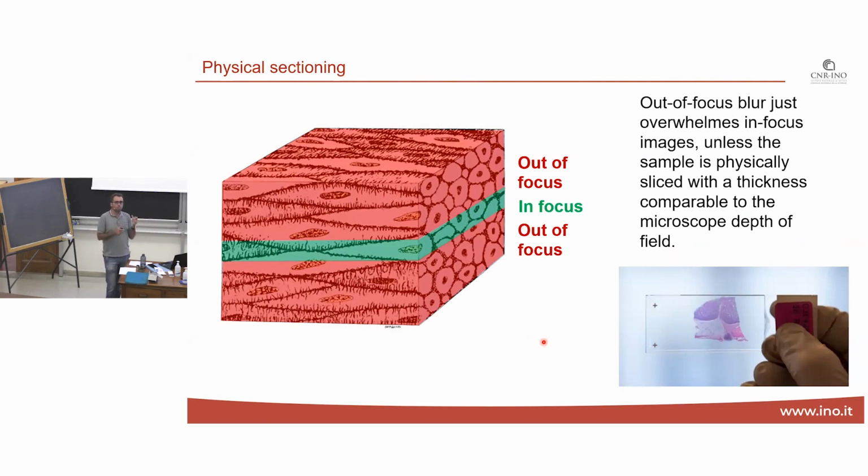In our three-dimensional bladder that we have acquired with light sheet microscopy, it doesn't look like this. It looks different because it's fluorescence, whereas this is a pigment. So instead of pink and violet on a white background, it looks red and green on a black background. It depends on where you store the channels. If I store one wavelength in the red channel and one other wavelength in the green channel, I get an image that looks red and green with a black background, like the ones that I showed you from the two-photon microscope. But then we apply a color transformation and we make these three-dimensional tomographies look like violet and pink with a white background.